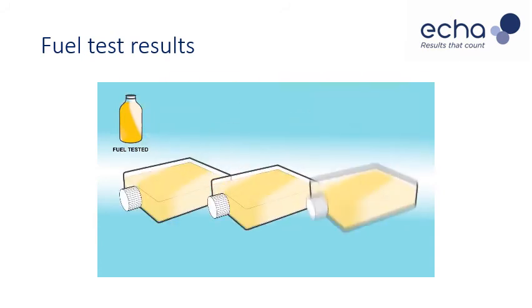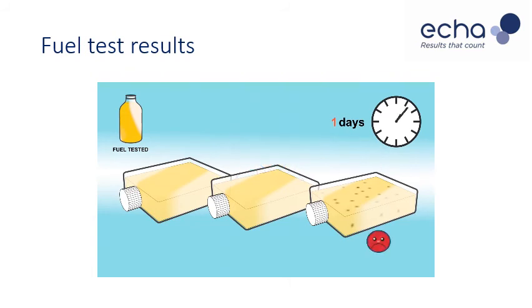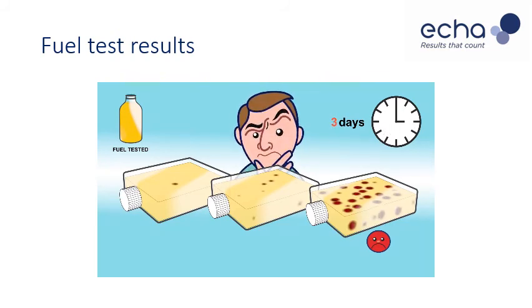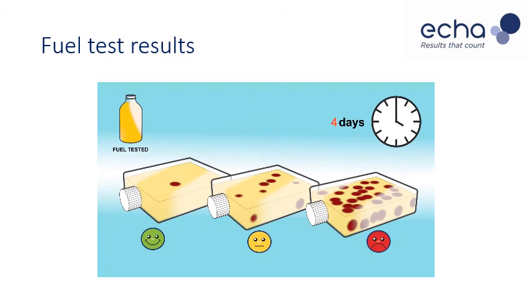Here we see the examination of tests of fuel samples over 4 days of incubation. If a fuel sample is tested, there will generally be far fewer microorganisms present than in water samples. In fact, for clean fuel, you will typically get a clear test with no colonies, or maybe just 1 colony. Again, heavy contamination may be detected after only a day or 2, at which point further incubation can be stopped. Otherwise, continue to incubate the test for up to 4 days, at which point the final result can be read.